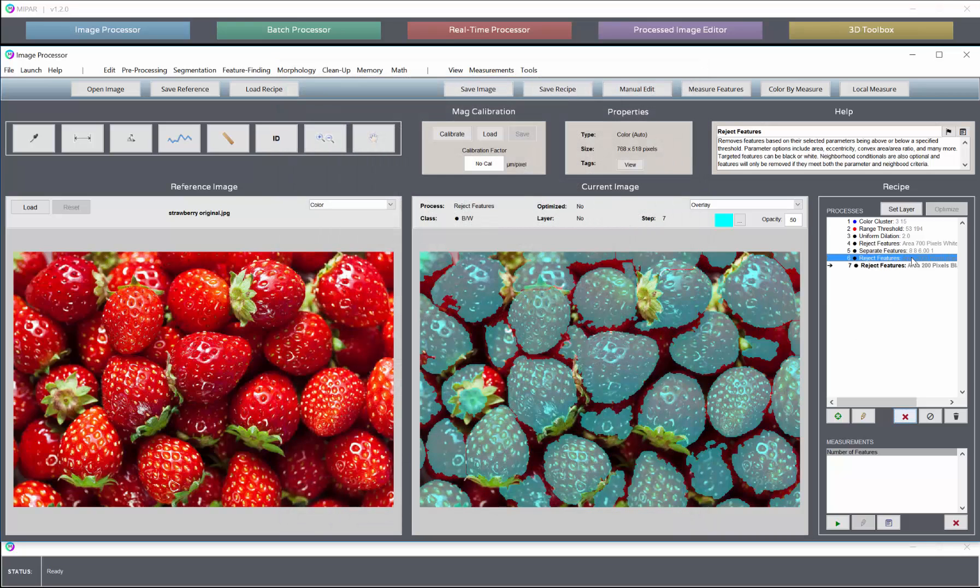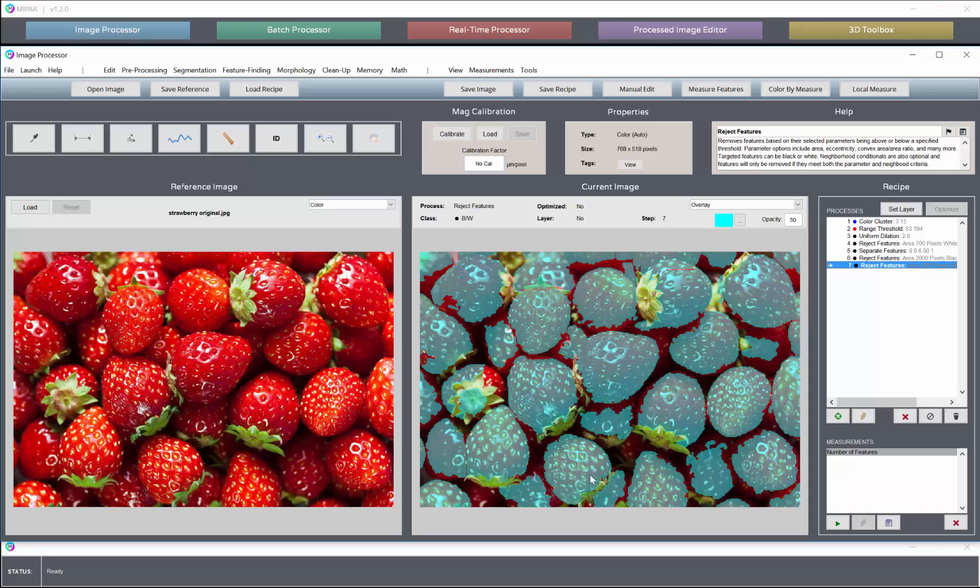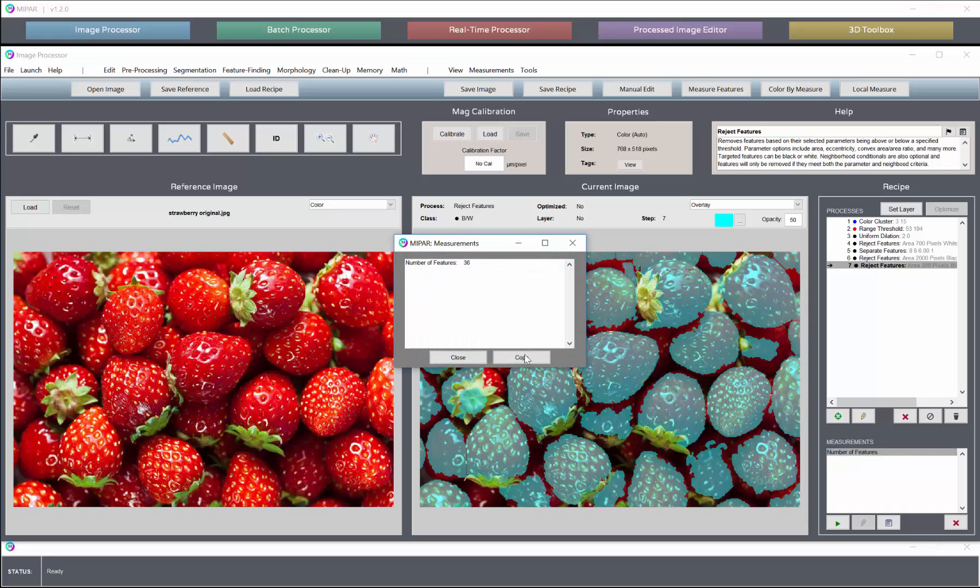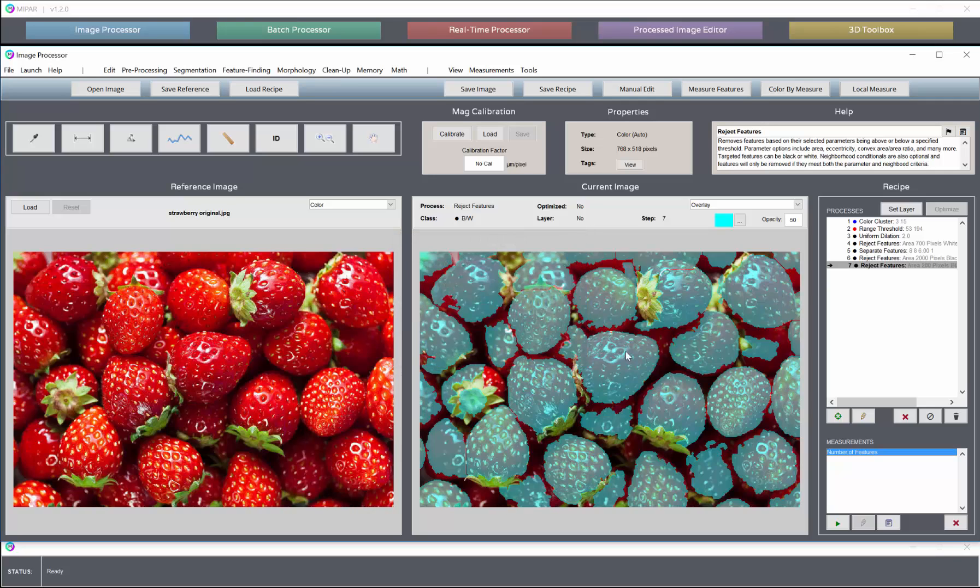So we have an aggressive rejection step that ignores the edges, and one that is less aggressive but includes the edge features. We now count 36 total berries without having to sacrifice any of the edge objects.